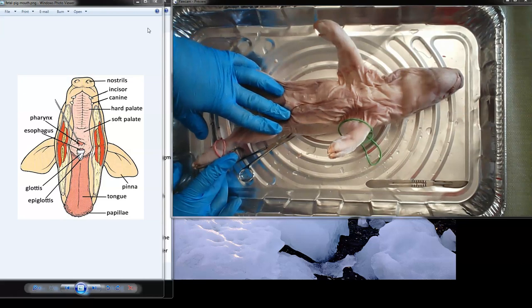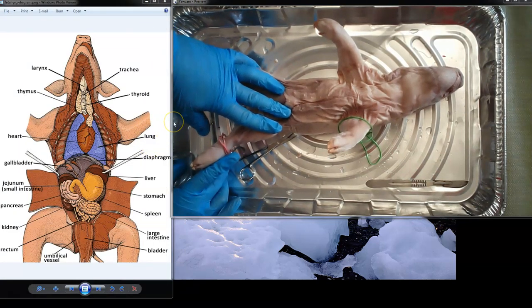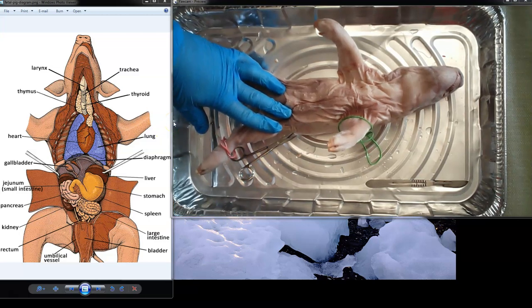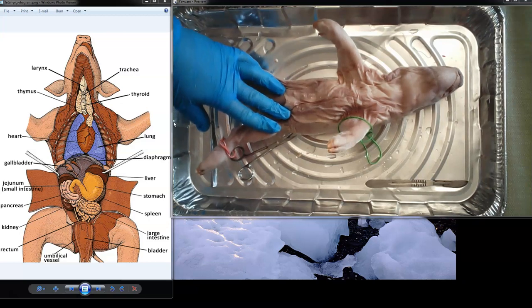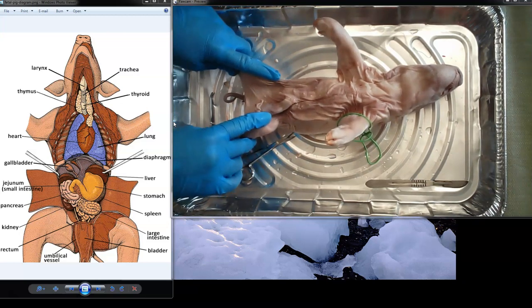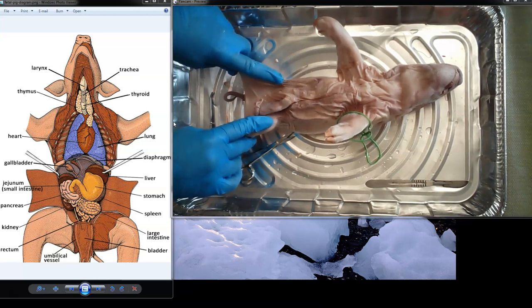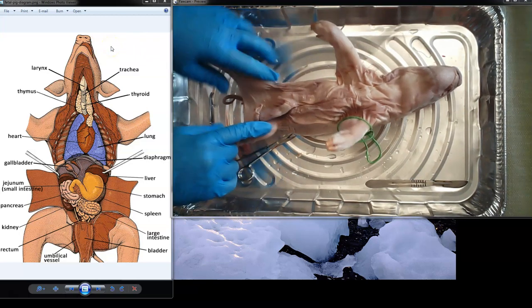Okay, so I'm going to ask my son to close the second picture. All right, so now you have this picture. This is our internal anatomy of the pig. And there's a ton of stuff there. The picture that you see at the side of this pig is full of color. The lungs are blue, the heart is red, the stomach is yellow, the intestines are a pale color. It doesn't look like that inside the pig necessarily.